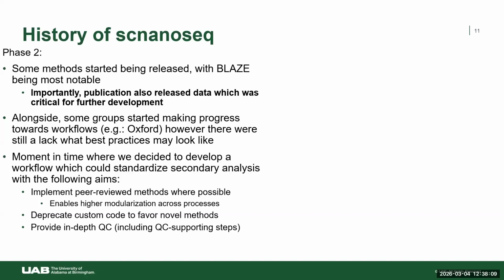We also wanted to make this workflow QC heavy, because that was something that, in 2022, workflows just didn't provide. And we did work with some investigators that had QC issues where we needed quality control metrics to help them troubleshoot their actual library preps. So even things like trimming the data. I remember that Oxford's pipeline didn't have that. They deemed it unnecessary to trim based on quality, but I disagreed with that heavily. I think eventually they added that into today's version.